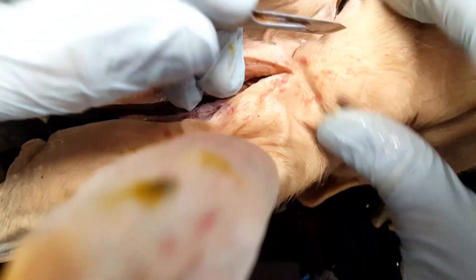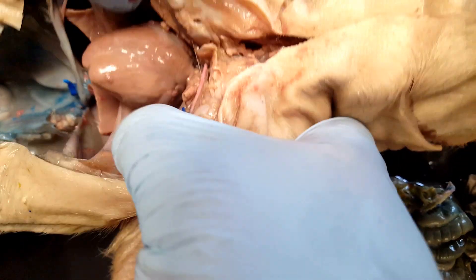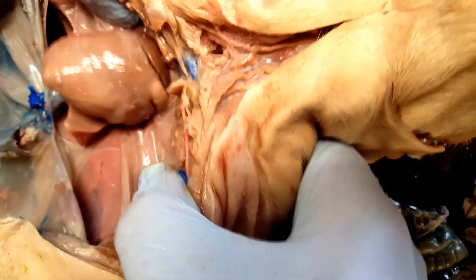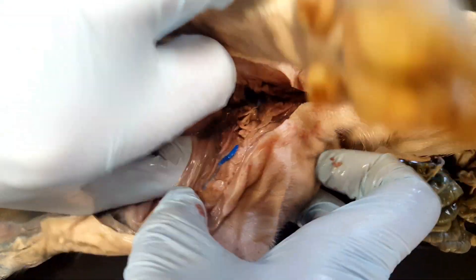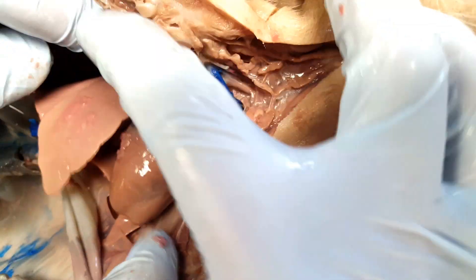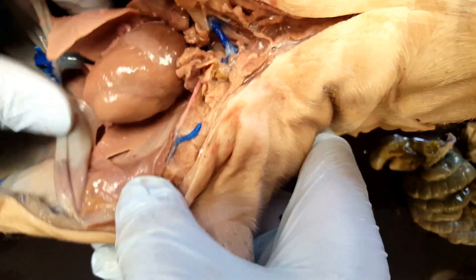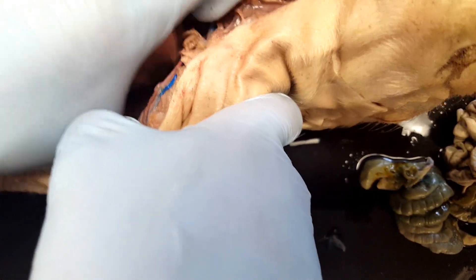If we move into the thoracic cavity, we can see right away the heart right there in the middle, which is normally surrounded by a pericardium, but I've just ripped the pericardium off of it. Now if we look on either side of the heart, we'll see the lungs. So here's our heart, here is the right lung, and here is the left lung.